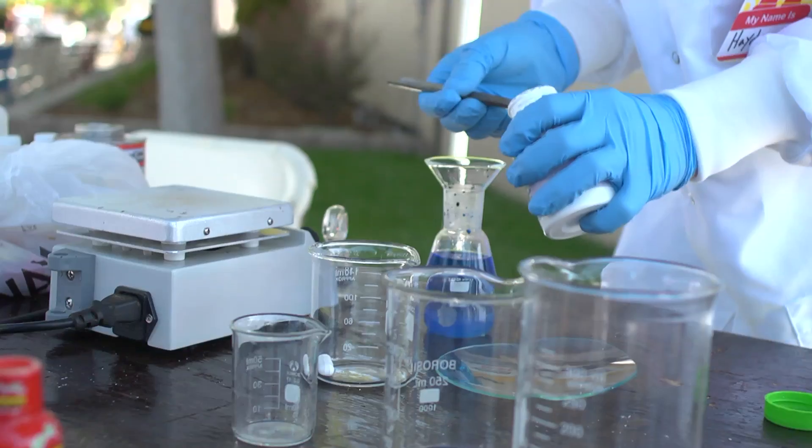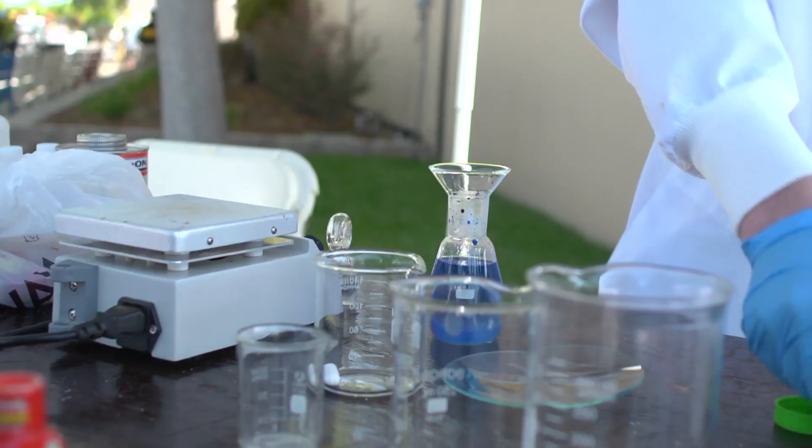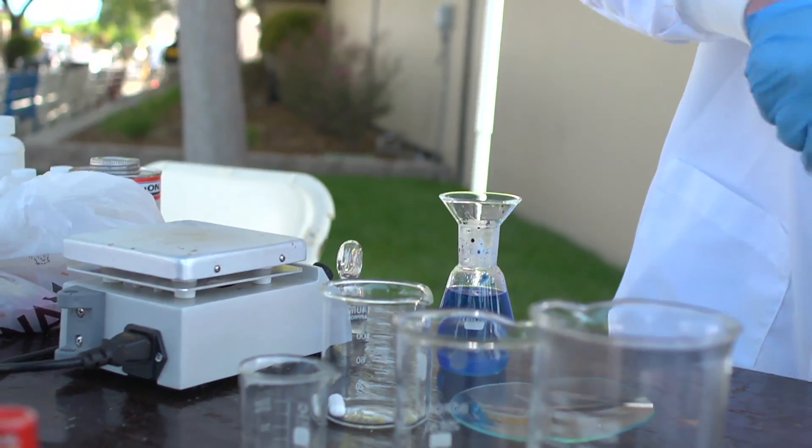I've kind of built up a lab at my house and I've learned a lot online through textbooks, and I've kind of made my own self-made hobby of home chemistry.